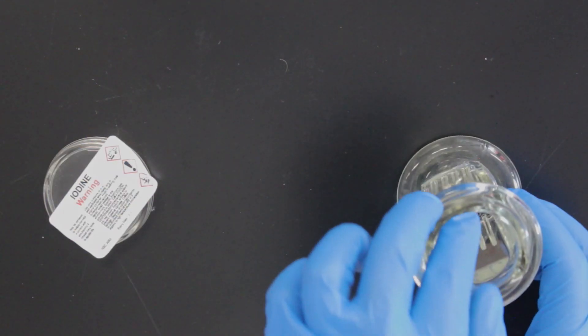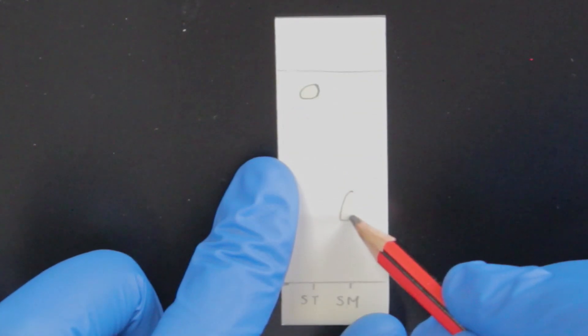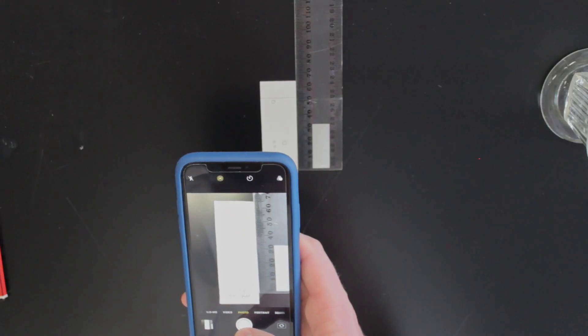Once it's done, take it out and lightly draw circles around all the coloured spots. Take a photo of your plates next to a ruler for your lab report. This way you can calculate the RF values directly from the photo.